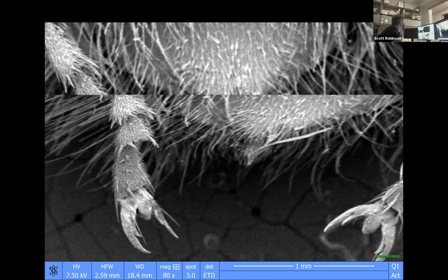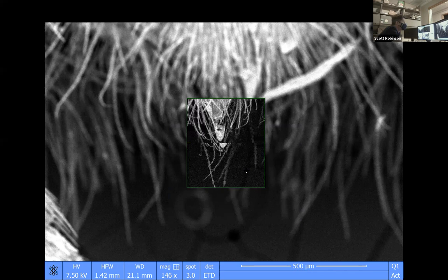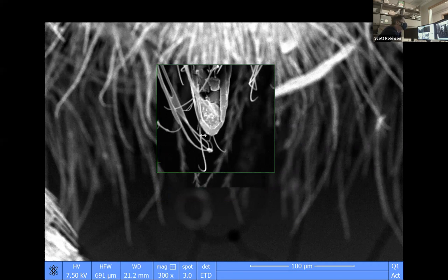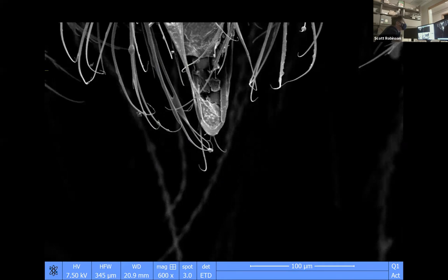We're going to look and see if we can see the stinger. The stinger is kind of covered by hair, but you can see it. Also, I should say that we're never supposed to call them hair, but we do, because hair is different than setae. So this is the tip of the stinger, and it's not too much to look at. Sometimes they're a lot cooler looking and a lot creepier. I'd like to go and look at the mosquito now, unless somebody wants to see something else.